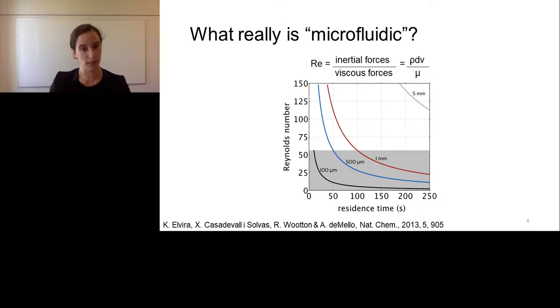So let's go back to basics. I'm not going to go too deep, but it's a good idea to understand what really is microfluidics. Okay. So on this slide, you will see an equation for the Reynolds number.